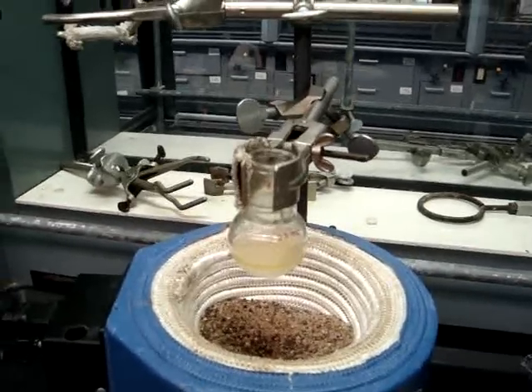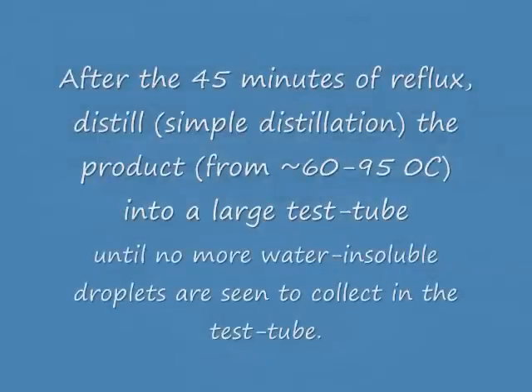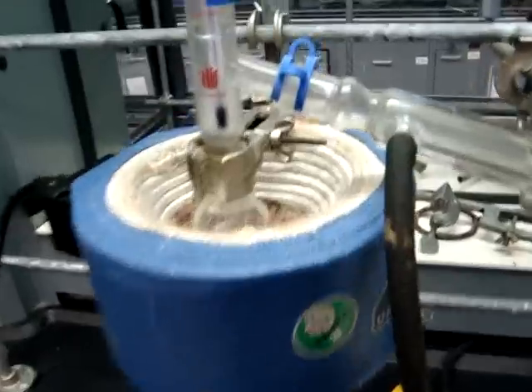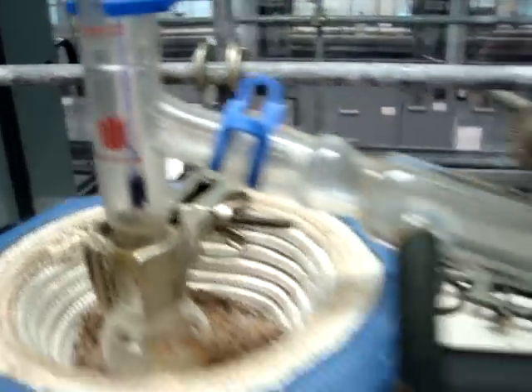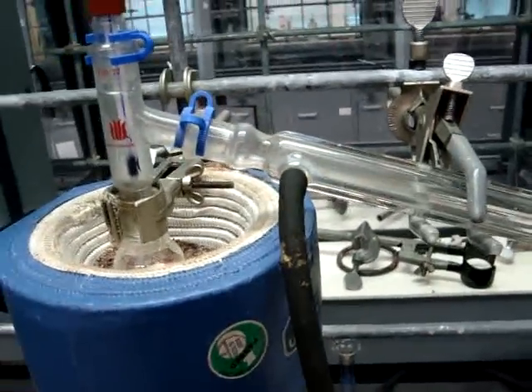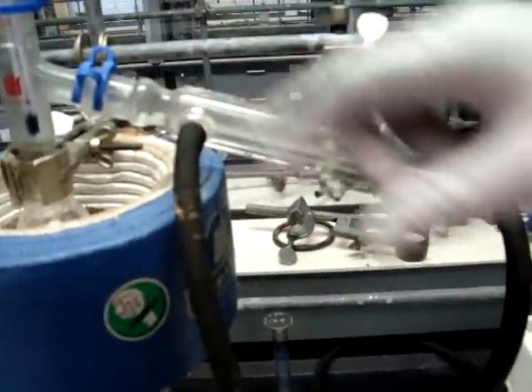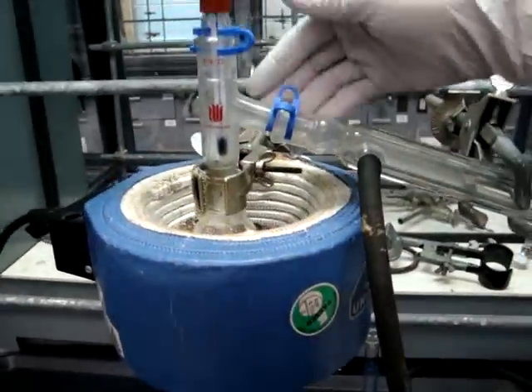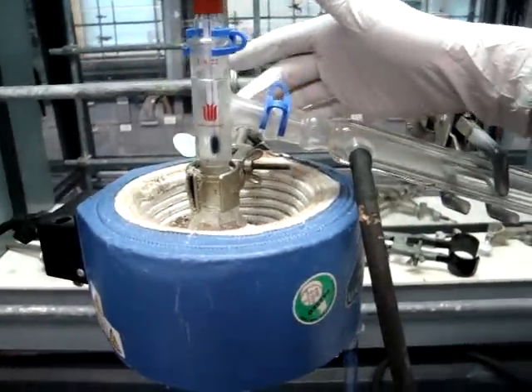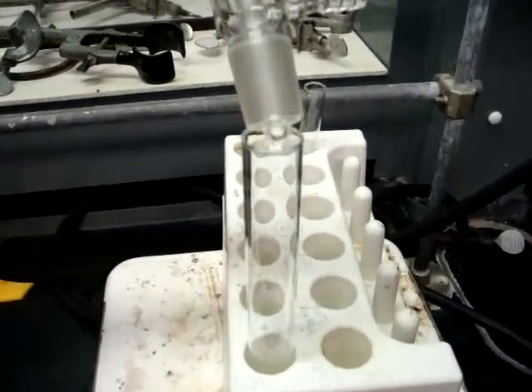Now, you will be setting up a simple distillation as you have done previously. We have set up a simple distillation. Make sure that everything is clamped, and you have your water in at the bottom and your water out at the top. Also, make sure that your thermometer is below the entry for the vapor so that you can accurately tell the temperature. You want to make sure that you are distilling at 60 to 95 degrees Celsius.